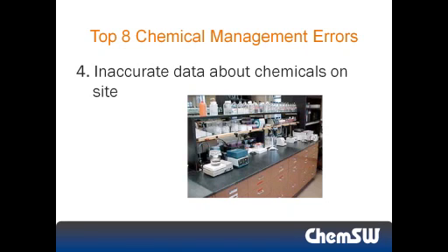I was at another organization about 6 months ago and was on a tour of the facility with the EHS director, and I asked him a question about how he was able to know what he had on site and how each lab reported their specific inventory. He walked over to a folder that was placed on the outside of the laboratory and said, "The laboratory is supposed to update these sheets once a year so we know what's in the lab." And he said, since it's so time-consuming for the researchers to actually audit their inventory, we only require them to do it once per year.